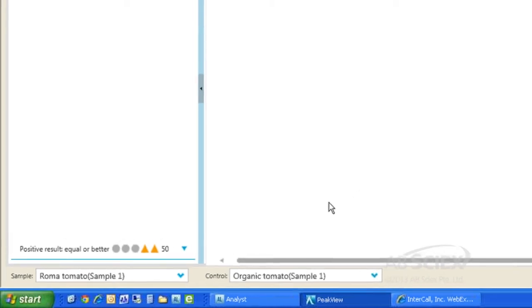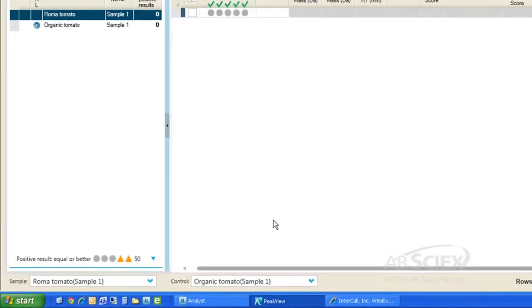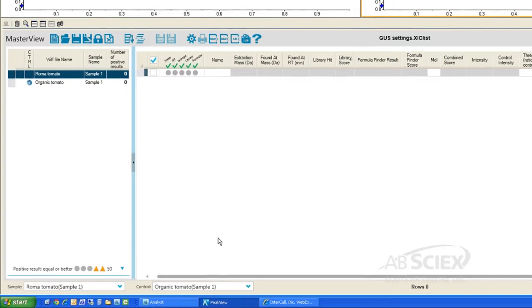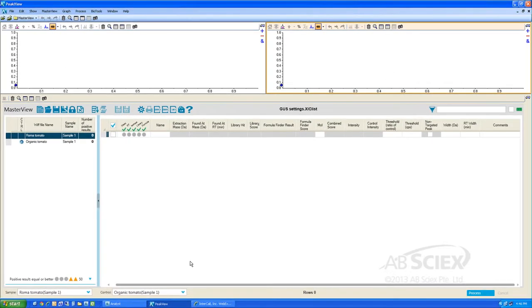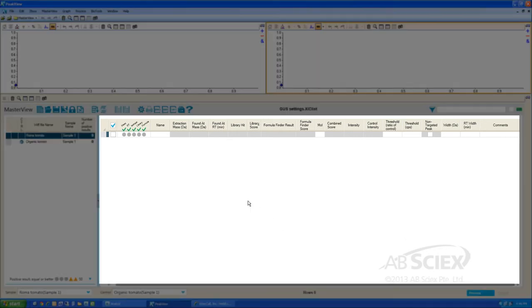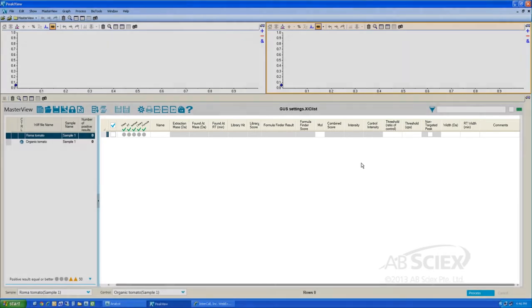Here we will set our control sample as the organic tomato sample. Since we are performing non-targeted analysis, you can see that our XIC list is blank. In this case, we will tell the software to extract all ion chromatograms detected in the sample above a set threshold to identify any and all peaks that were detected in our unknown sample.